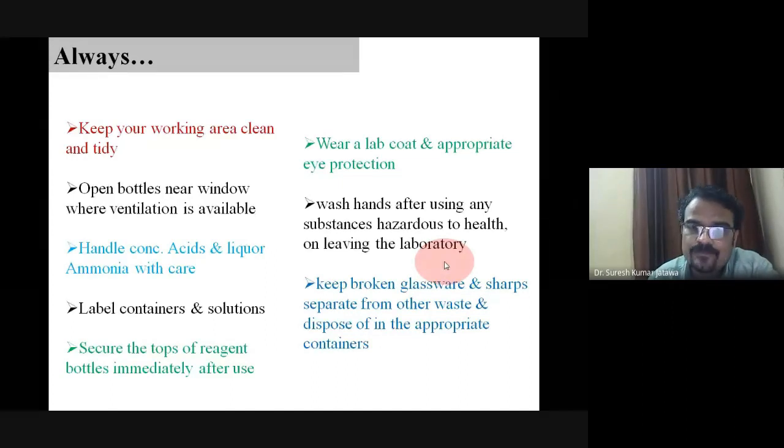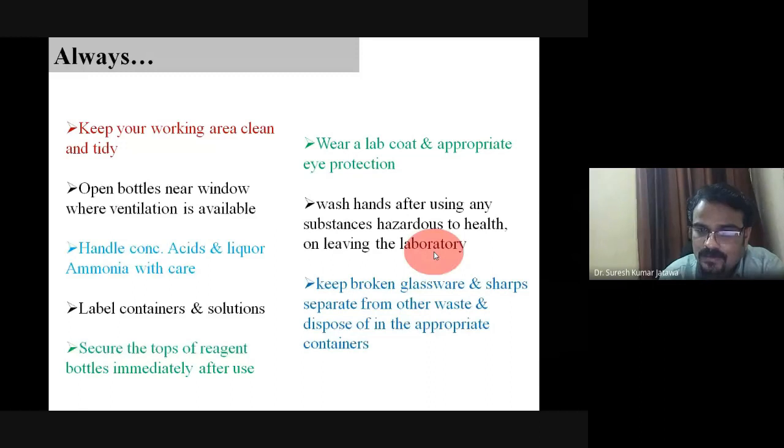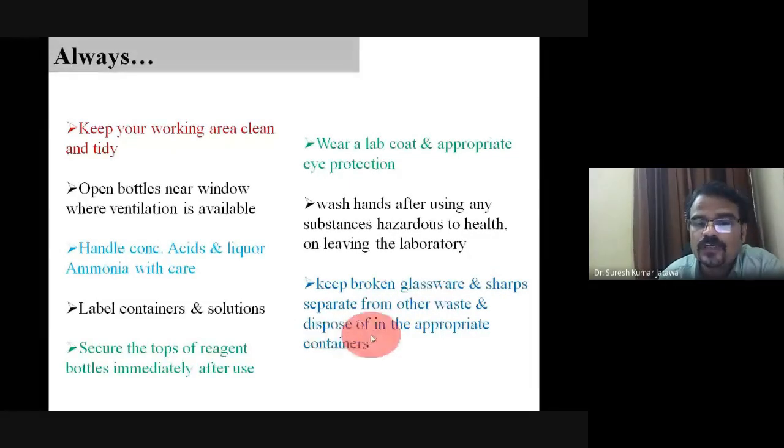Wash hands after using any substance hazardous to health and on leaving the laboratory. One thing is very important, that is about broken glassware or sharps like needles. Keep broken glassware and sharp material separate from other waste and dispose of in the appropriate containers. This is a very important thing.